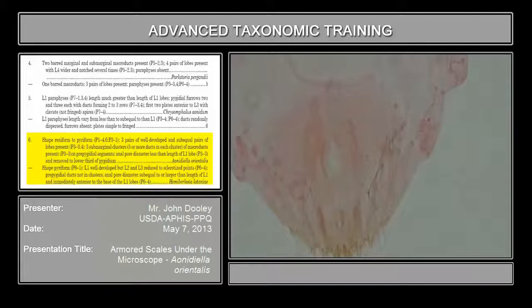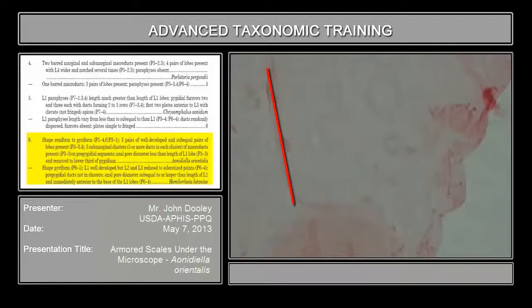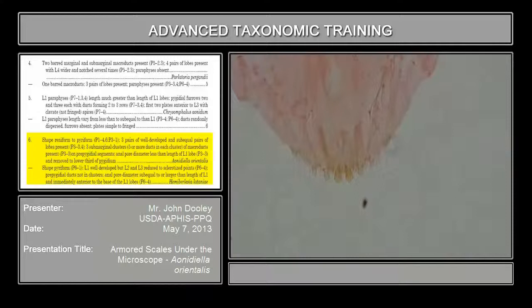Then there are sub-marginal clusters of ducts. If you look at this one, start at the lowest one — this is the edge of the pygidium right here. Here's one cluster; it has to be five or more ducts. Second cluster: one, two, three, four, five. And up here: one, two, three, four, five, six, maybe seven. So you have three different clusters. That's specific for this species.